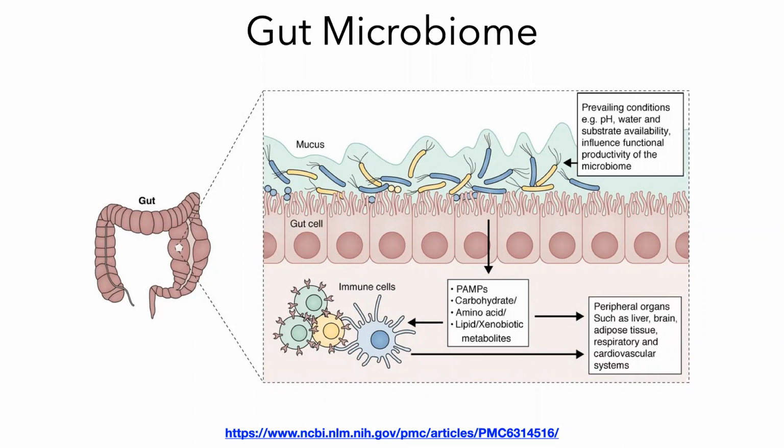You want to select a data set that has good data. That good data set means it's got the metadata that could answer your question. For example, Dr. Singhal, right, you were asking, where's the control? Here we don't have a control, right? So how would you compare it to a control? You can't in this specific example. How could you understand whether that person eventually had a lethal outcome or a non-lethal outcome? Again, you cannot answer that question.